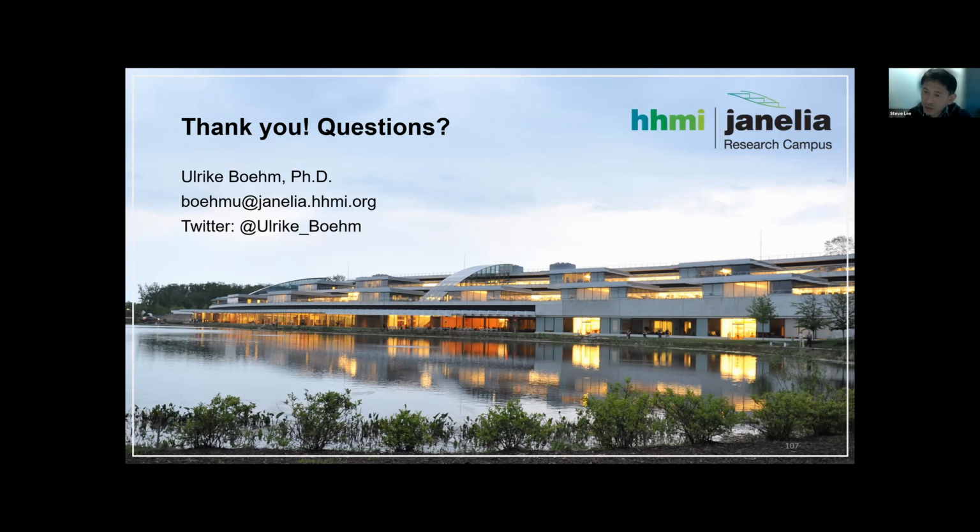The last few slides you showed were very impressive, where the correlative imaging at low temperatures of single molecule imaging plus cryo. That seems very tough and seems very unique. Is there anything special about the sample prep, particularly to achieve that localization?